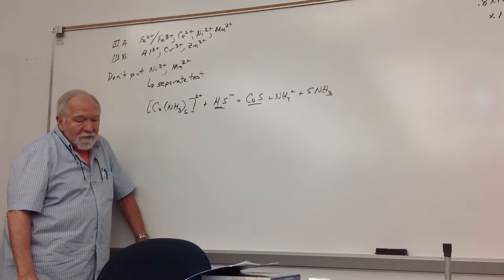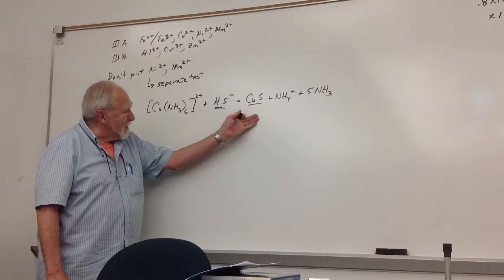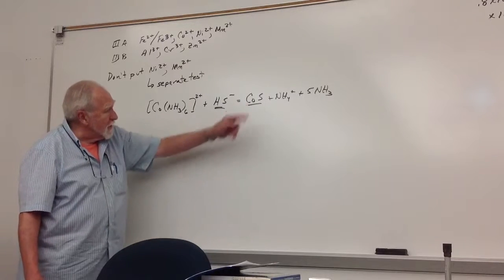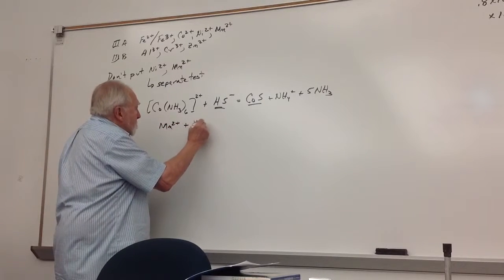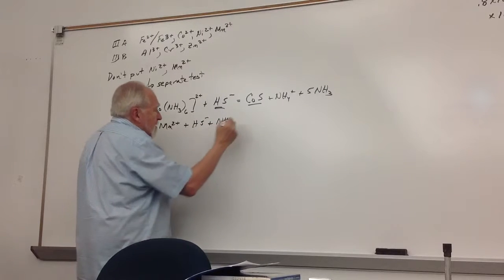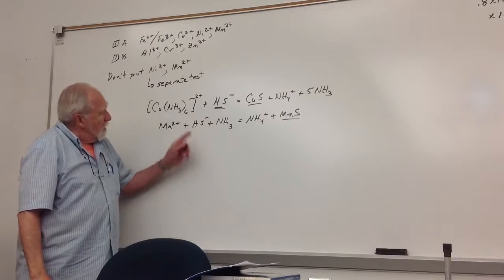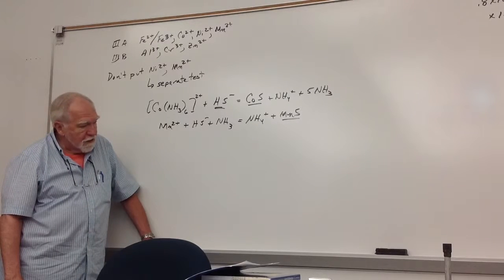manganese, which doesn't form a complex ion, is even easier because Mn2+ plus HS- gives MnS plus H+, and I guess you have to have some ammonia because it's a basic solution, because you can't get an H+ in the basic solution. Basic solution of ammonia when you're doing this, the 1 drop extra. Okay. So all I'm trying to point out to you is the equations are fairly simple for the sulfide precipitation.